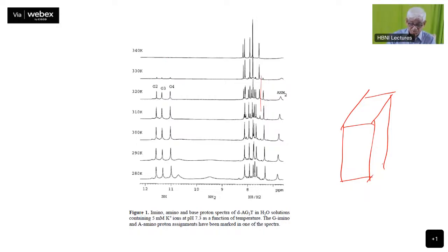And the very unique thing which was observed in this particular situation was the A NH2. A NH2 is also stable. Normally you don't see the amino protons stable.